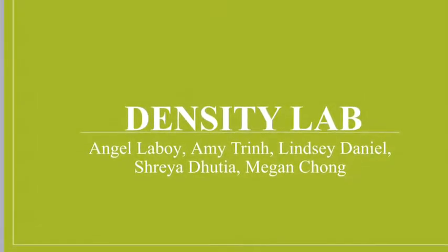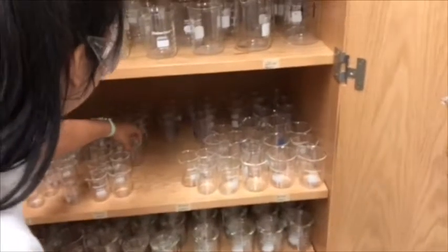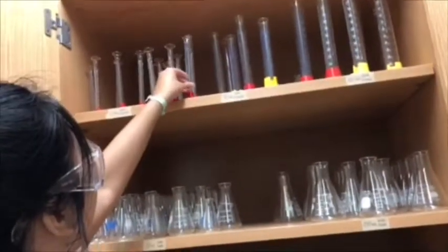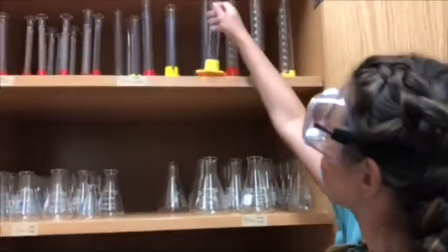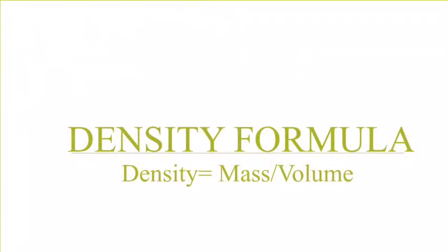For exercise 1, we will be determining which vessel is more accurate when it comes to measuring density, a 10 milliliter graduated pipette or a 100 milliliter graduated cylinder. To do this, we took the density of different amounts of water measured by both vessels and compared. Density is measured by dividing the mass of a liquid by its volume.